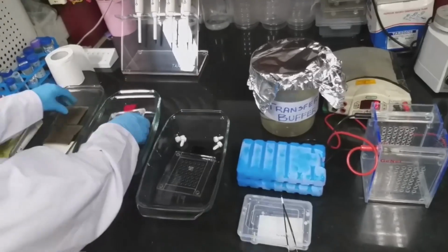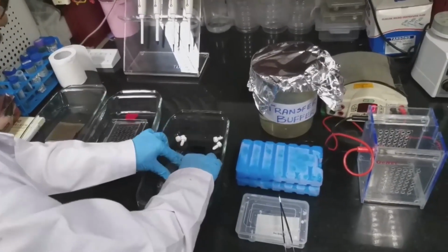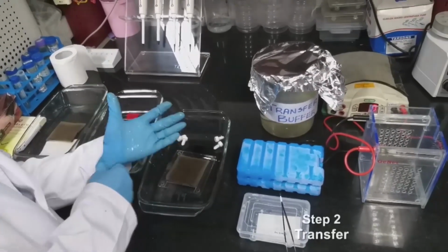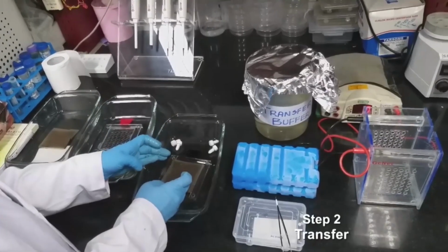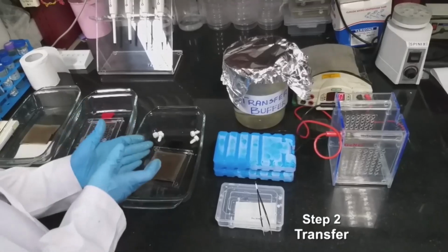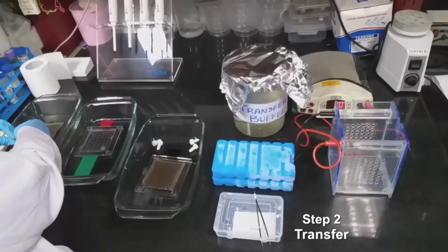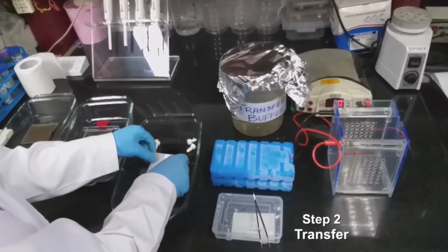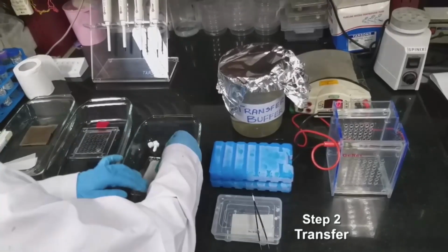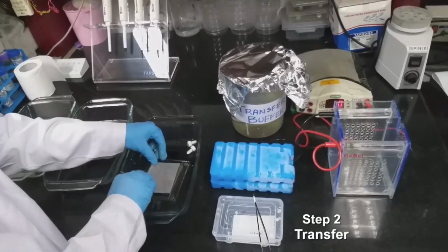First, for doing that, we need to keep these sponges, and this may give some non-specific binding to the membrane. So what we will do is put blotting sheets on top of this. After this you have to remove air bubbles, if any are present.